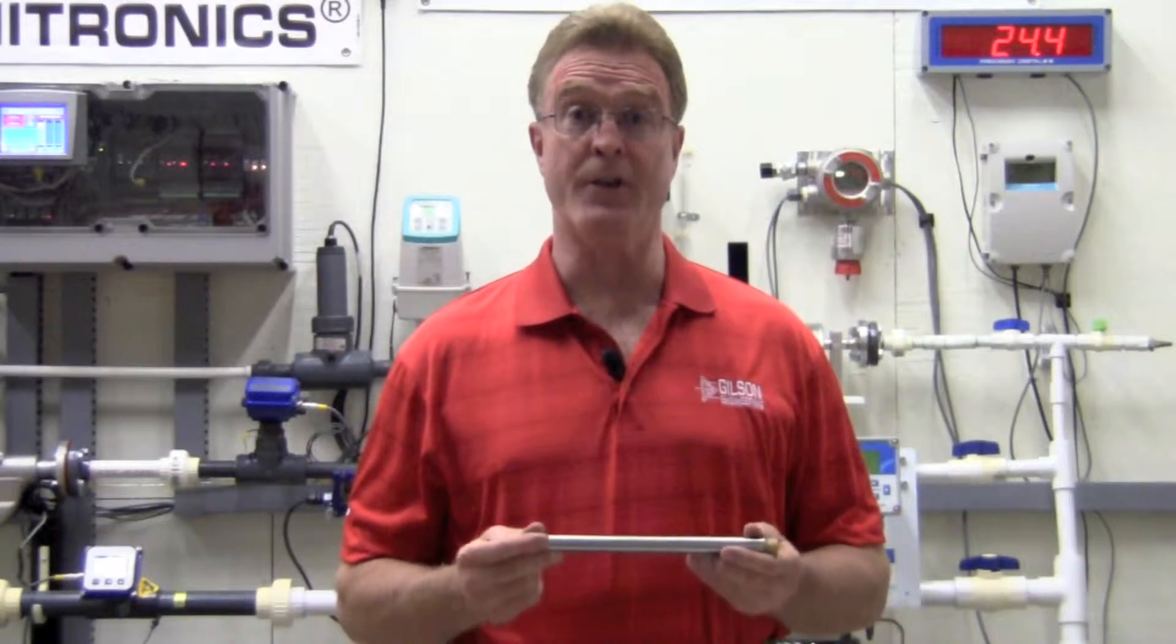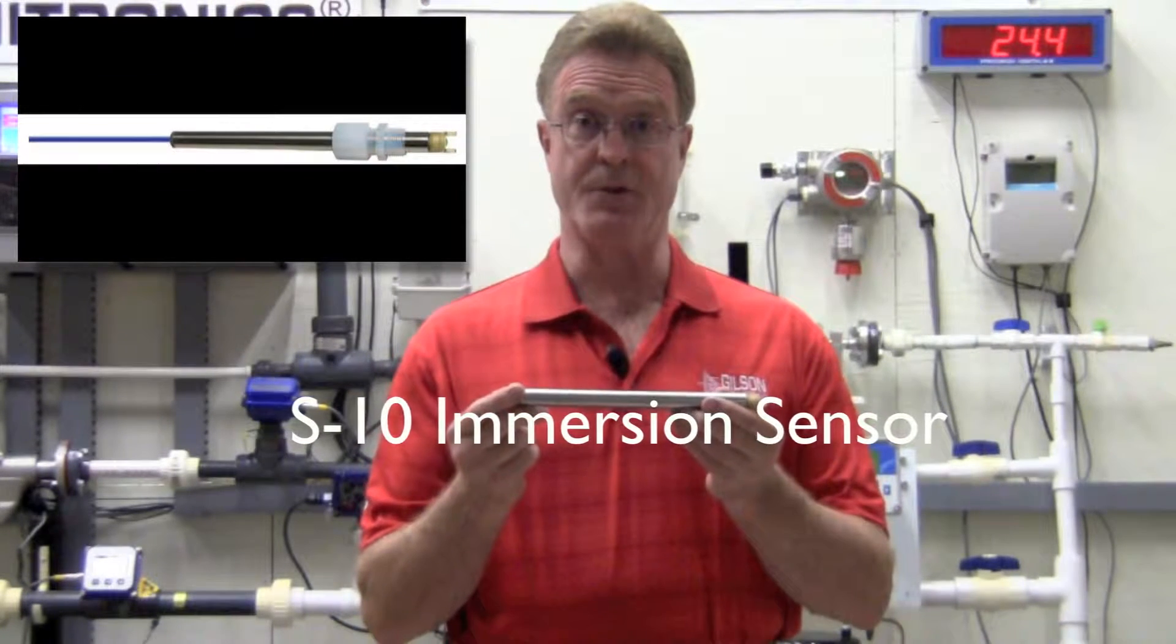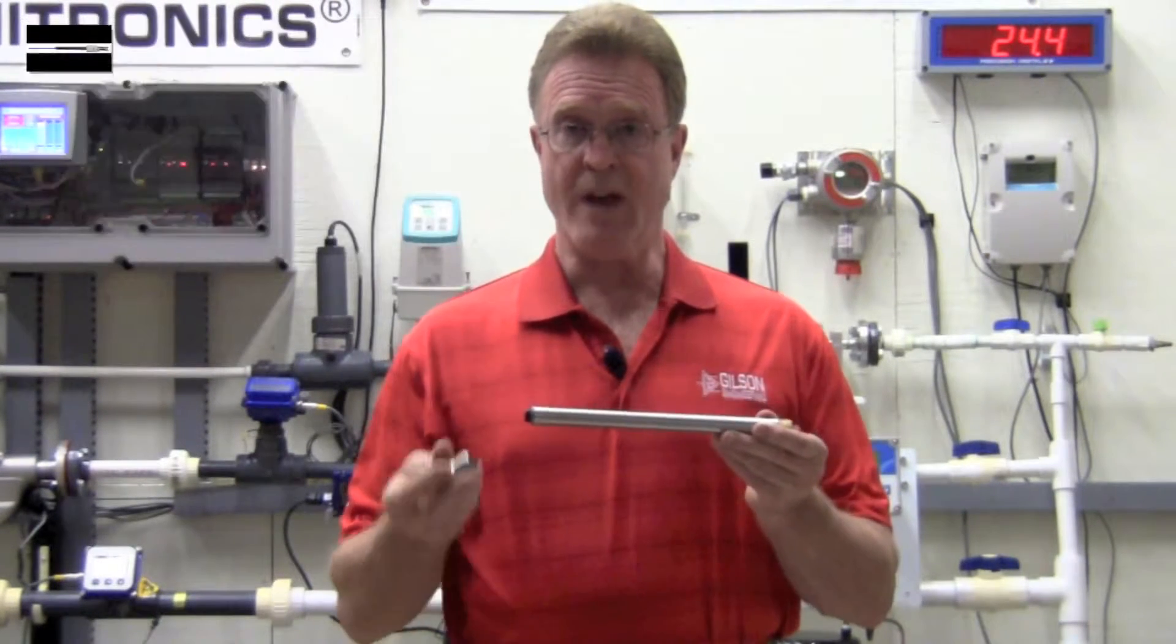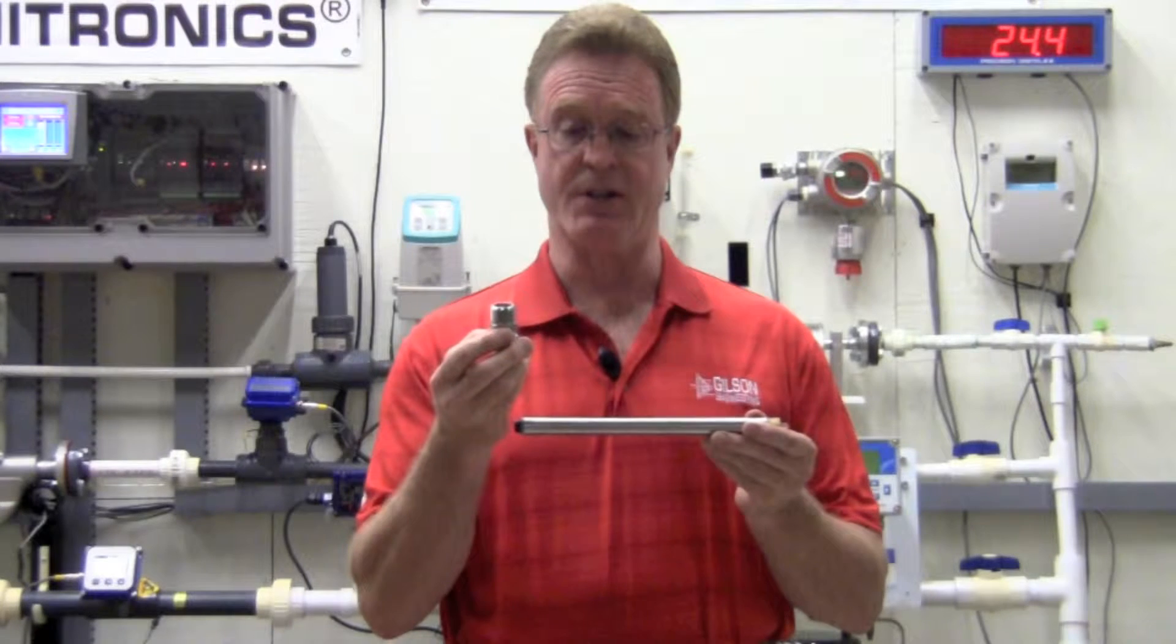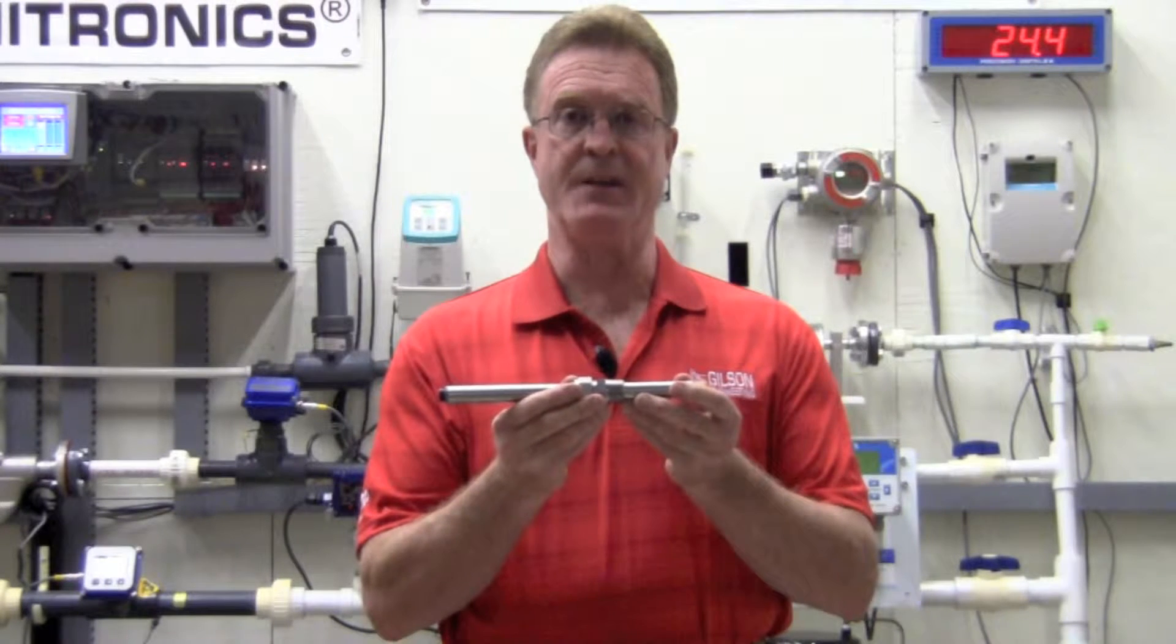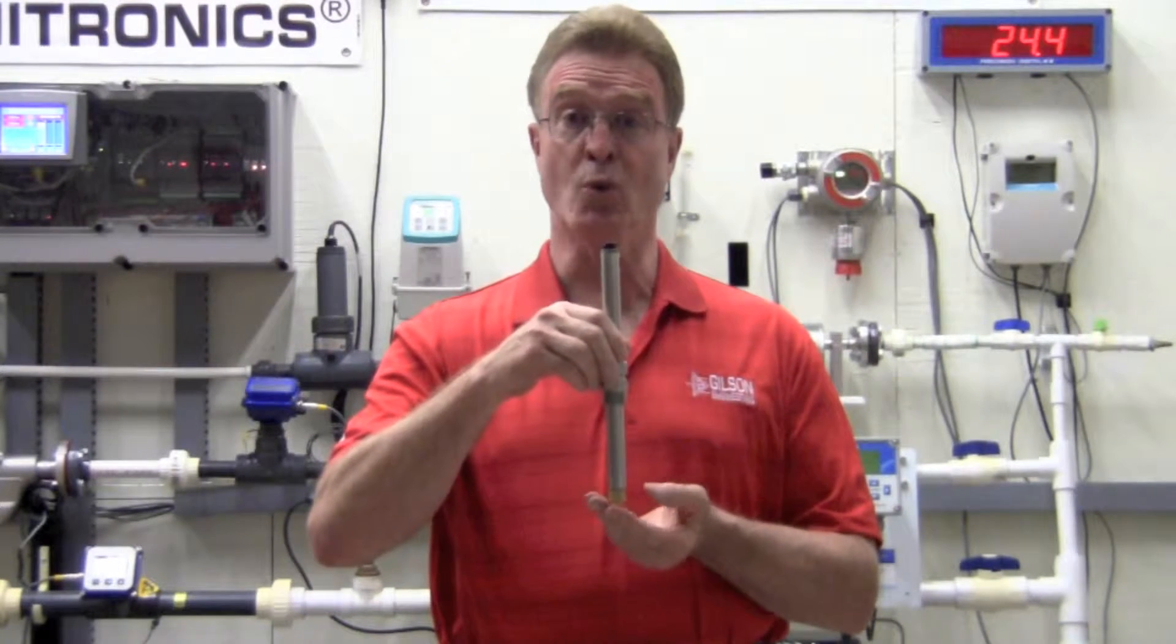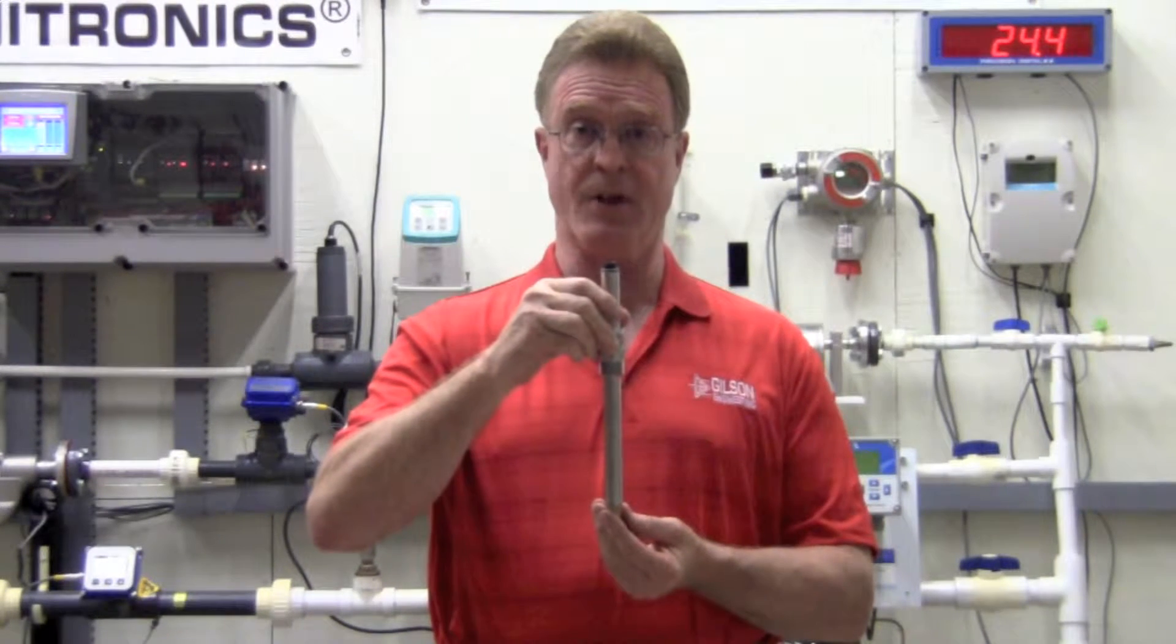ECD has traditionally made all their measurements with two basic types of probes. First we have the traditional S10 sensor, an immersion style sensor used for all different types of measurements. We have a compression fitting. This one I happen to have here has a three-quarter inch NPT process connection. It may be installed onto the S10 probe so that the three-quarter inch NPT threads face the process. And we use this in an immersion style so that if I were to go across a flume or a weir and have a three-quarter inch connection, I can lower the probe down into the flow stream.